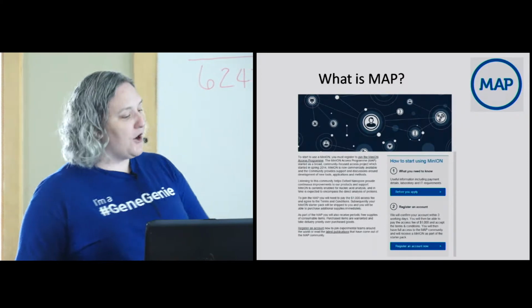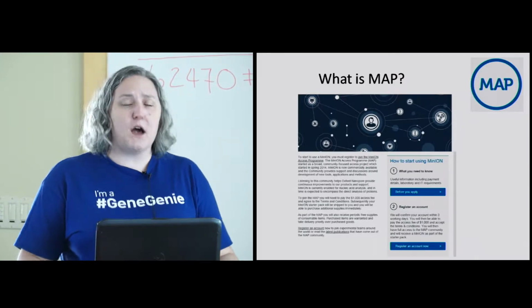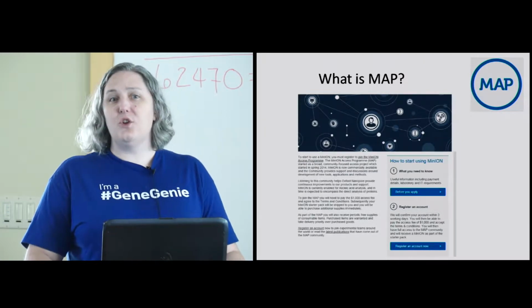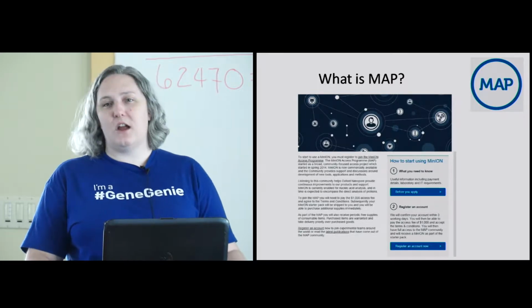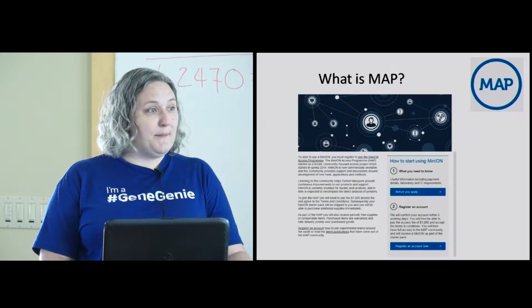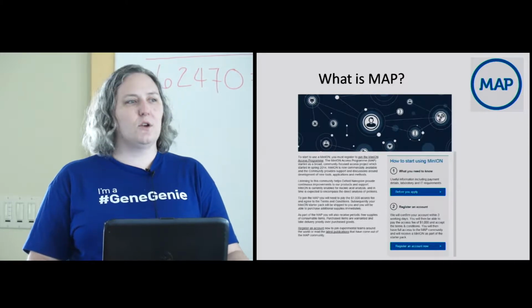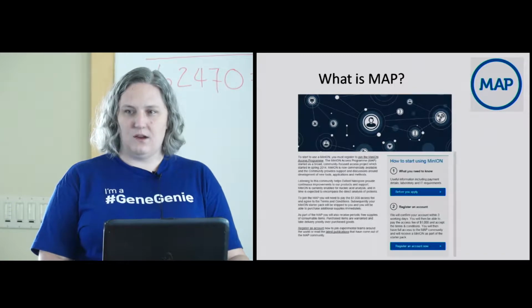The MAP is the MinION Early Access Program. A number of labs across the world gained access to the Oxford Nanopore MinION sequencing device. This allowed researchers to evaluate and experiment with this new nanopore-based sequencer, which was announced 2 years ago, but then no one saw anything for a while. Certainly, MAP is still open. Anyone after this talk, if you are totally enthused about the Oxford Nanopore device, you can most certainly sign up for MinION and get your own nanopore and do your own sequencing right at your lab.